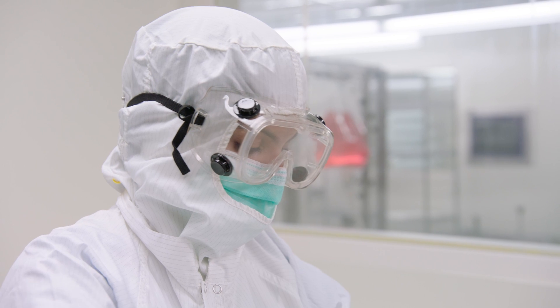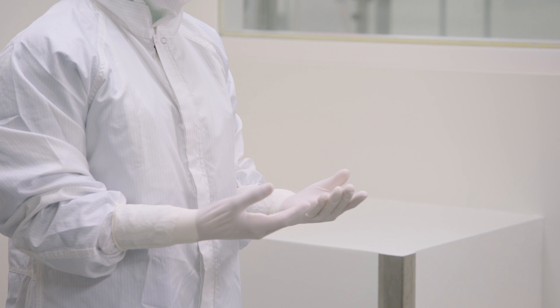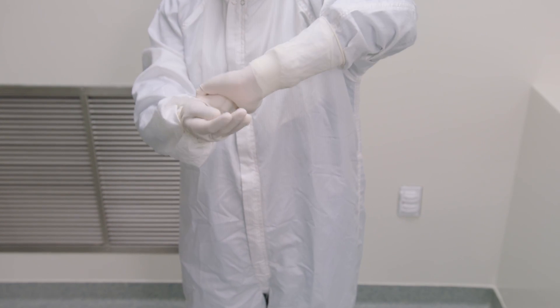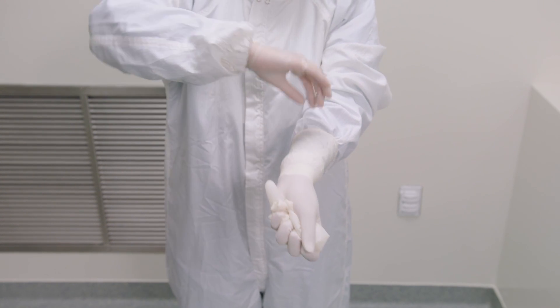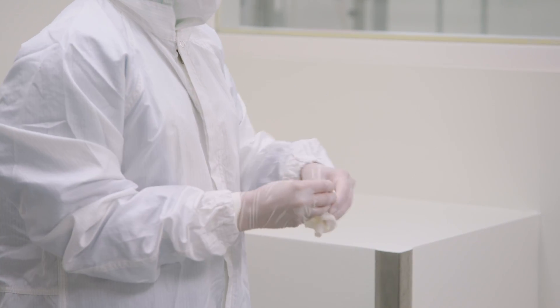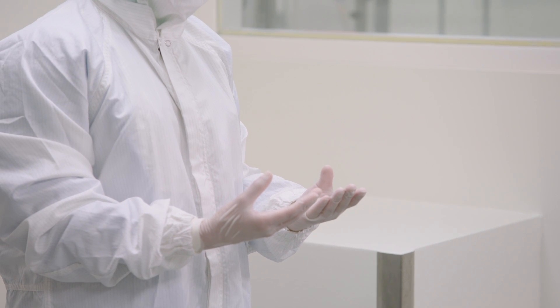How a glove is removed or doffed is just as important as how it is donned. Start by taking hold of the first glove at the wrist. Fold it over and peel it back, turning it inside out as it's removed. Once the glove is off, place it in the palm of your other hand. Then remove the other glove by peeling it back at the wrist, making sure your fingers are underneath the glove exterior to avoid contaminants.